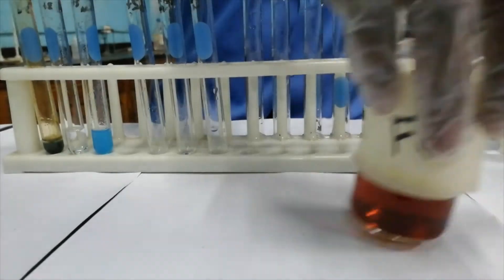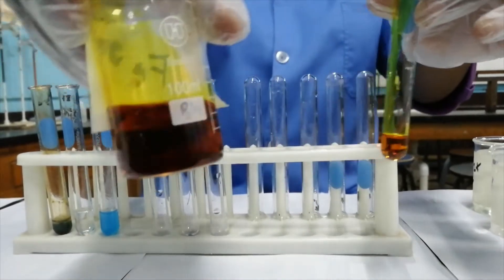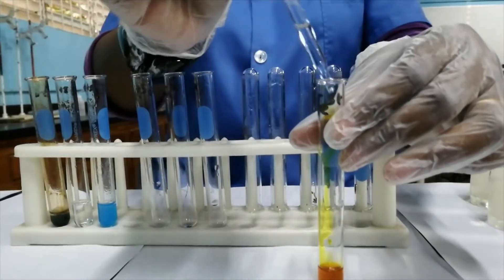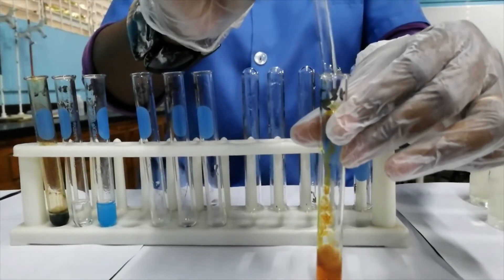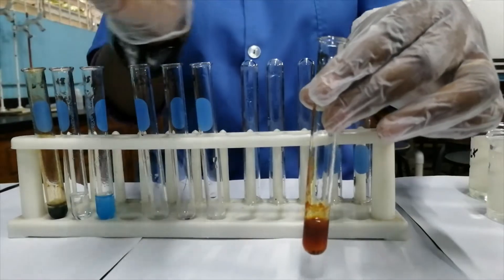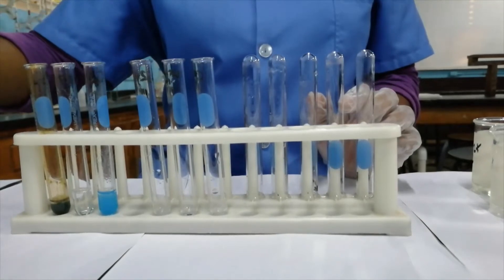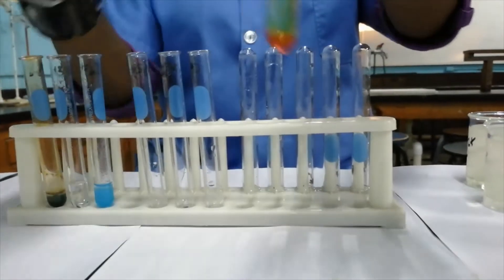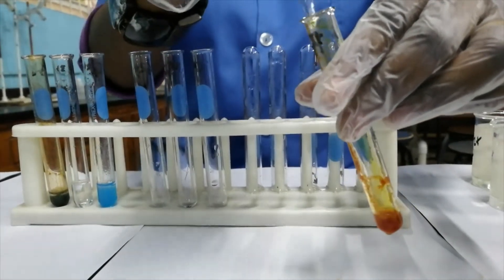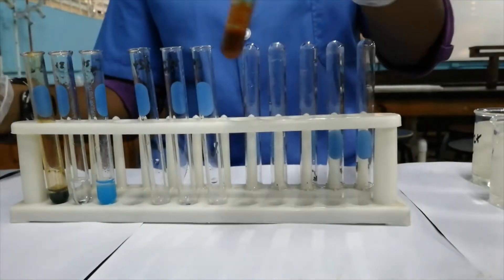The next cation that we'll be testing for will be iron(III). You can see the color of the iron(III) solution. When we add aqueous sodium hydroxide to it, what is formed is a red-brown precipitate. If we pour off most of this solution and test if this precipitate is soluble in excess sodium hydroxide solution, you can see that it is insoluble.